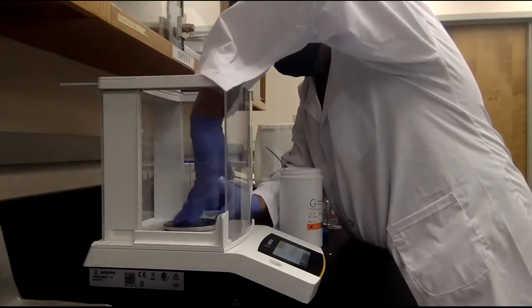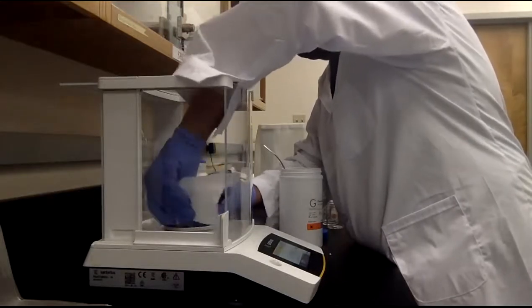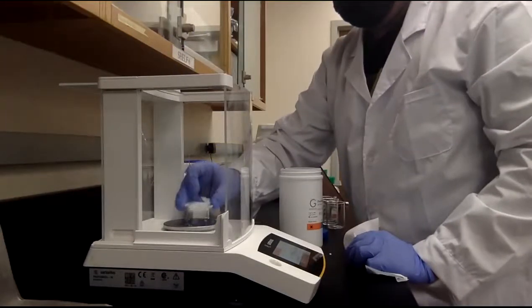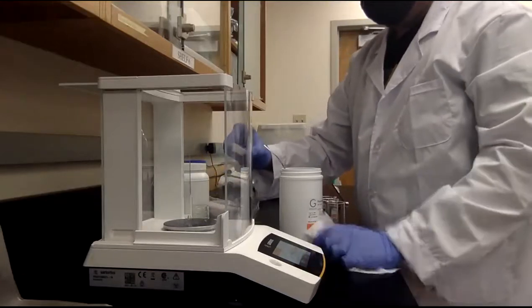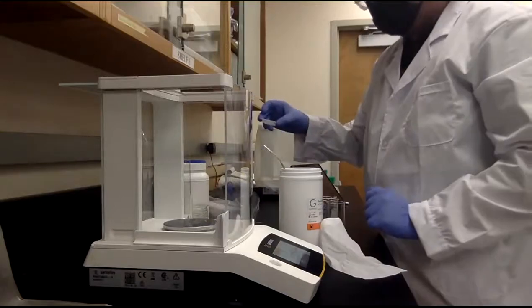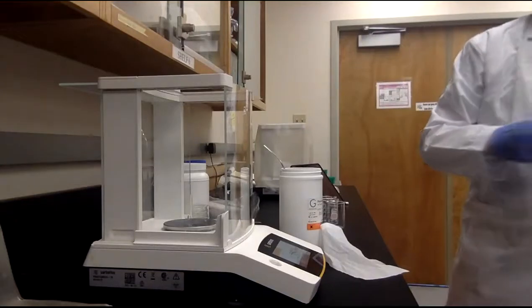Okay, let's use this one to clean it. I wouldn't recommend putting it back in, it's going to create impurities. Exactly. So we don't recommend you put this back into your weigh boat because these are not clean anymore. Oh, yeah, that's fair. We'll have to get rid of a bit of it anyways. So, do we have anywhere we can do some mixture? You can pour it here.